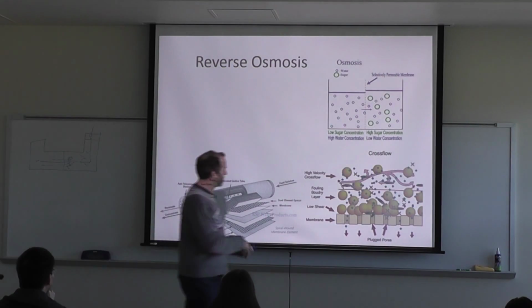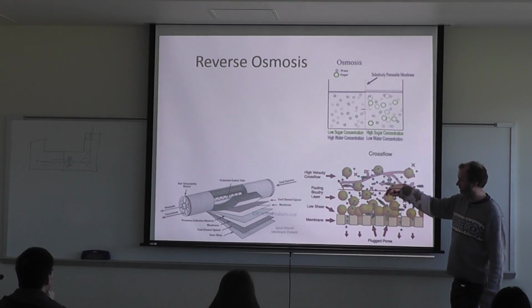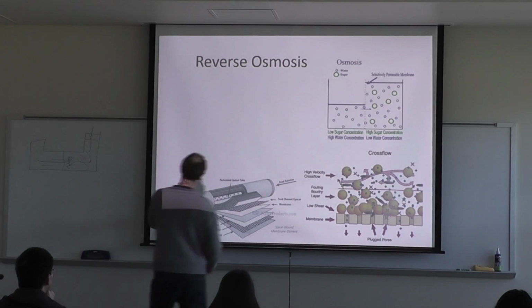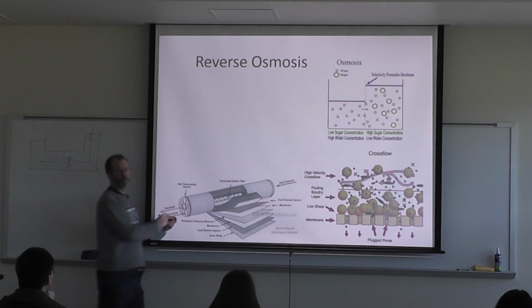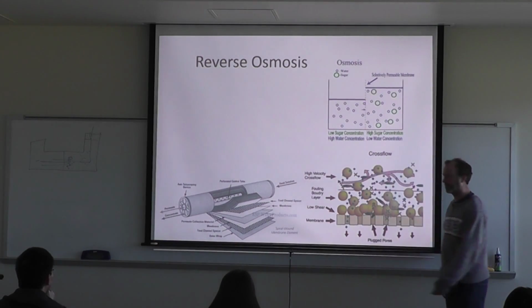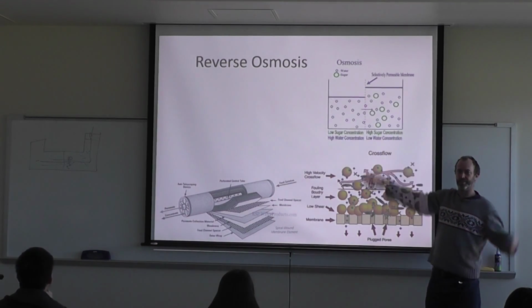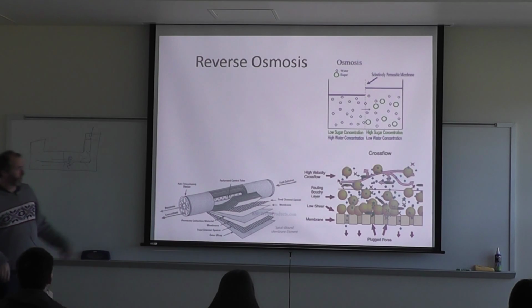They have a high velocity cross flow. The water goes across the membrane and is forced through the pores, and the pores don't get plugged up by all the particulates that way. So you have the permeate that comes out the center, the concentrate runs out the outside, and the feed runs in. Does that make sense? The water comes right through and is forced through, so you don't have this pumping motion that everybody draws for osmosis. It's just a single, constant flow reverse osmosis filter.